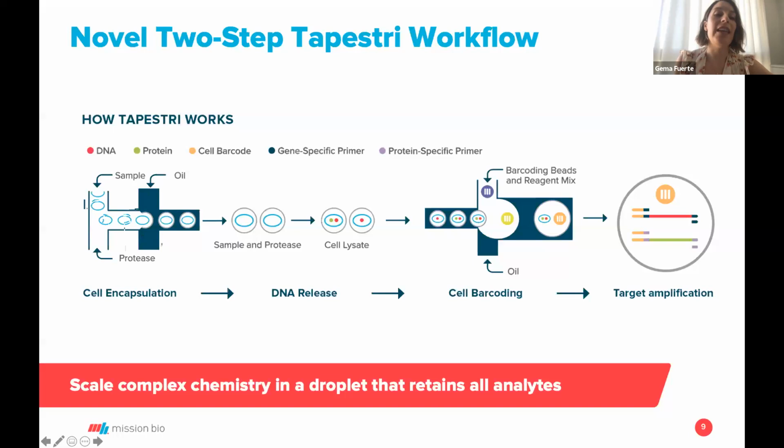This process only takes 5 minutes, and we follow a 5% Poisson distribution, which means that we generate millions of droplets and only 5% contain a cell. That is to avoid two cells being encapsulated together. So then we reduce the number of droplets.